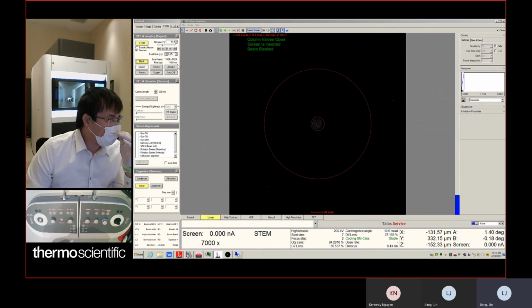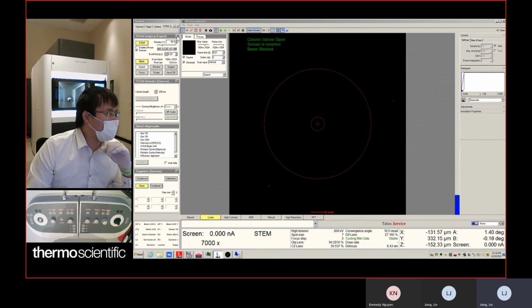We also have different views. We can do search, preview, acquisition. This is an imaging focus. You can choose your scan size here. You can choose your different focus. So you can use the intensity for focus. You can use the objective.